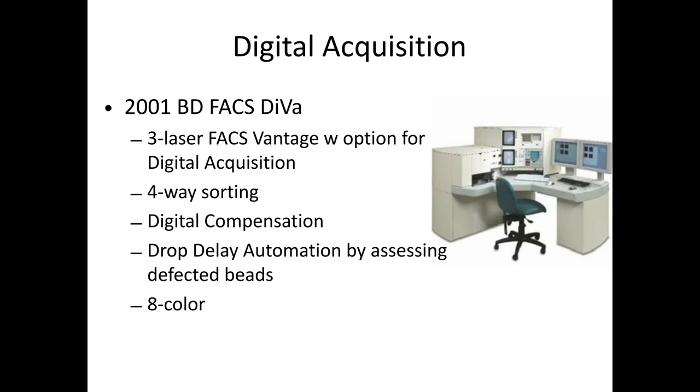And so finally, once the education spread, I was giving lots of talks on digital versus analog to explain it to people and explain the new bi-exponential displays and stuff like that, people caught on. But that wasn't the only cool feature with the Vantage.